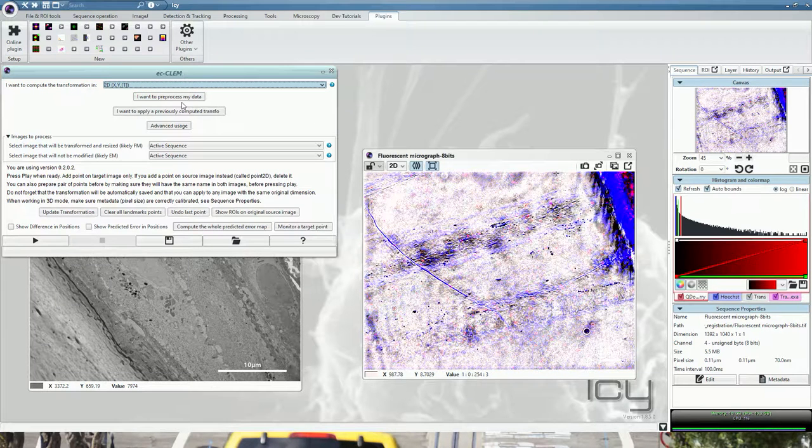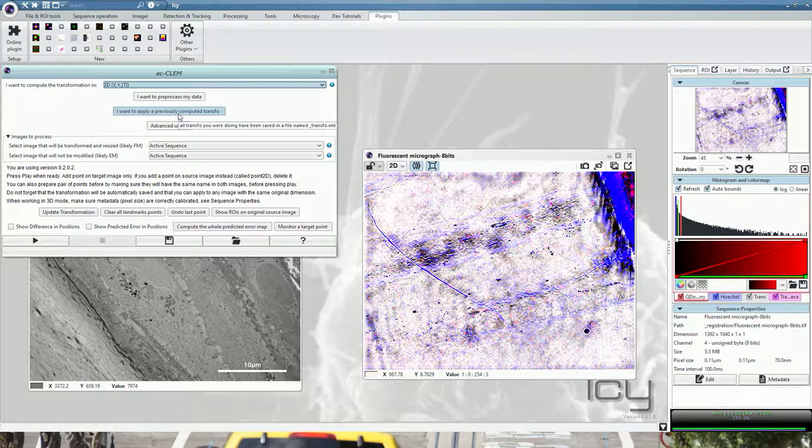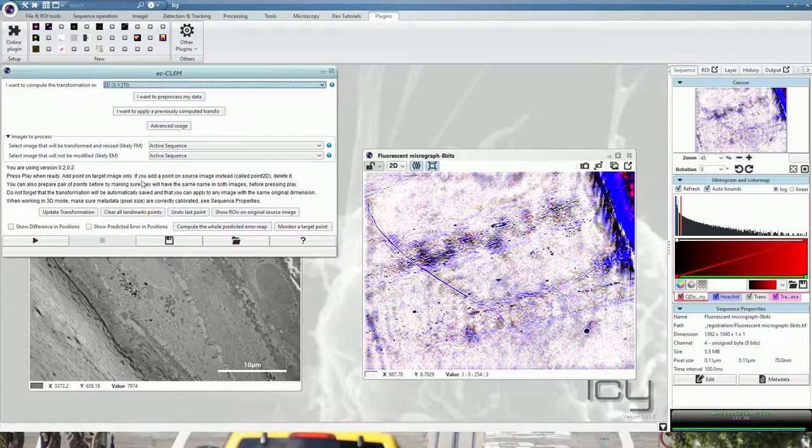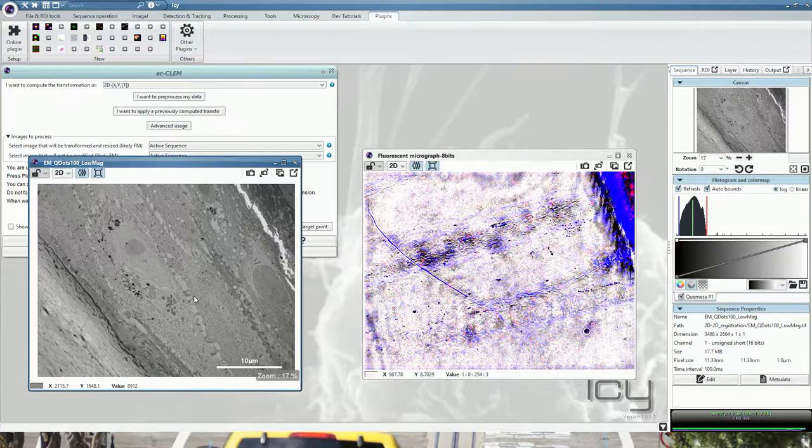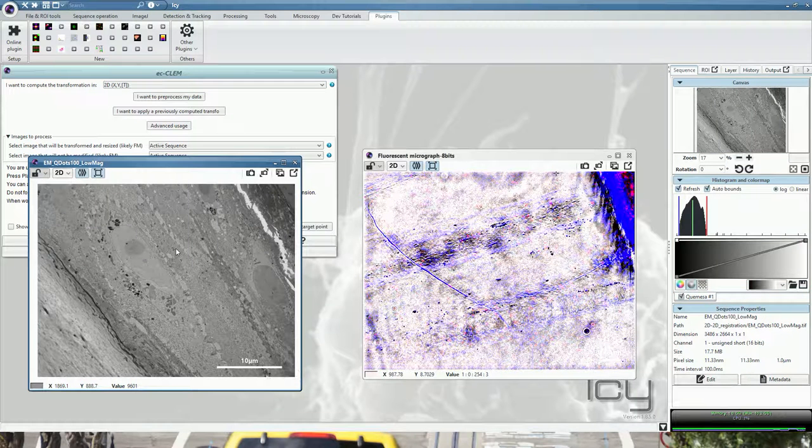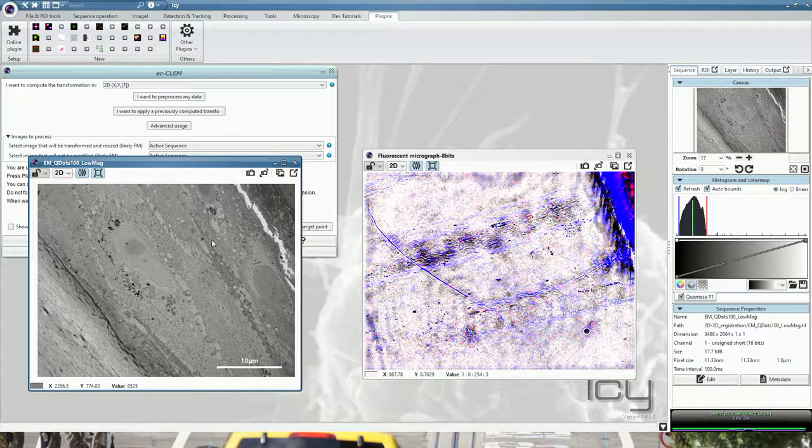If you want to pre-process your data or apply a previously computed transformation, advanced options will be described in another tutorial. The first thing which is important is to know what you want to register onto what, which will be the target and which one will be the source.